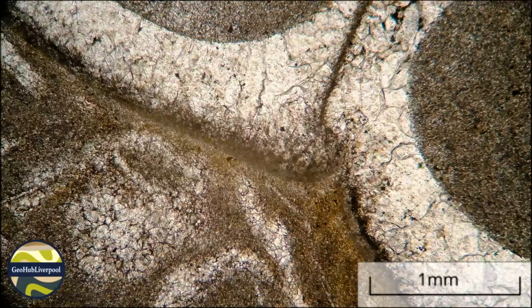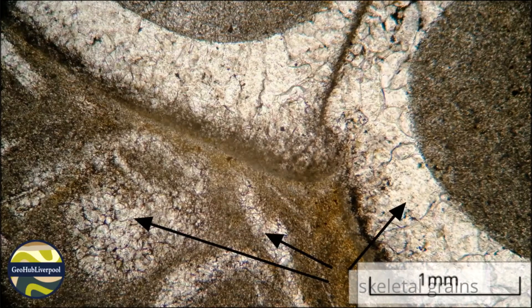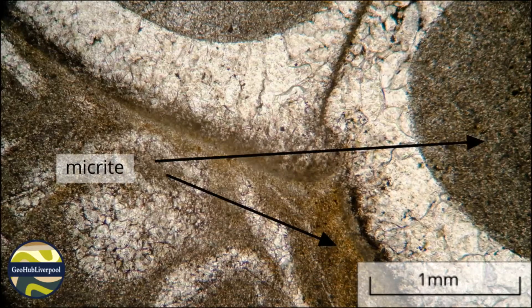This is a thin section which shows skeletal grains or bioclasts, and it is a sedimentary rock. Under plain polarised light, the skeletal grains are shells of different types. It is easy to see their outlines because they are colourless and are surrounded by areas with a darker brown colour. These dark areas are very fine carbonate mud or micrite. Micrite is less than 62 microns in size and they are little grains of calcium carbonate.